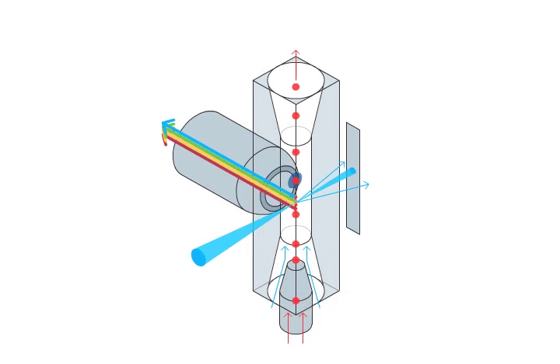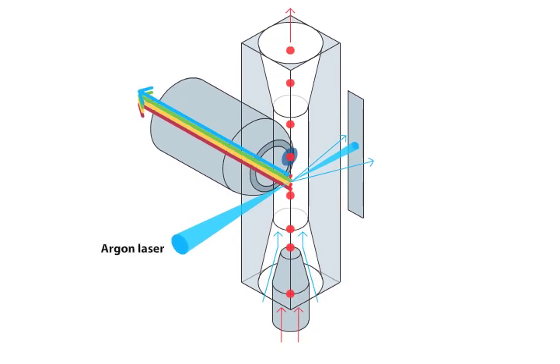The simplest cytometers use a single argon laser emitting a high-intensity beam. But more complex cytometers use lasers delivering 8 or more distinct wavelengths. Let's examine the steps of flow cytometry.